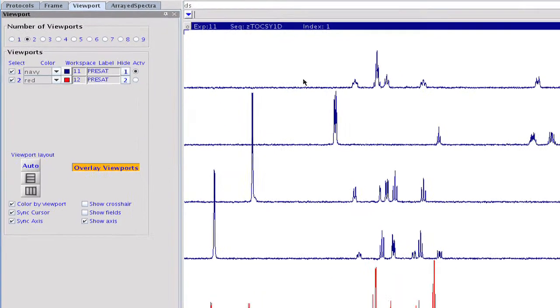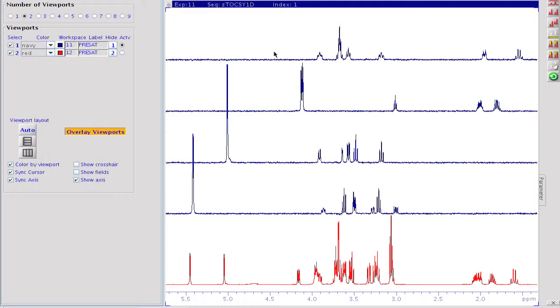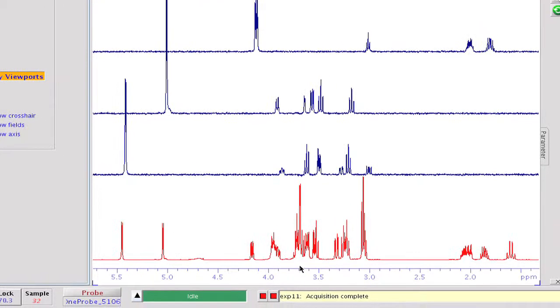We can clearly identify the four spin systems from top to bottom. The dezoxy sugar, the aliphatic side chain, and two ordinary sugar rings. The central part of the proton spectrum that suffered from multiple overlaps has become easily assignable.